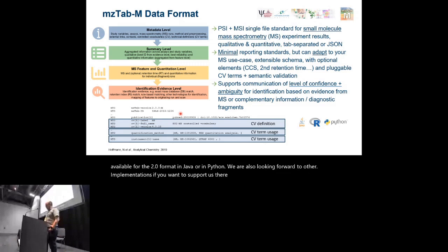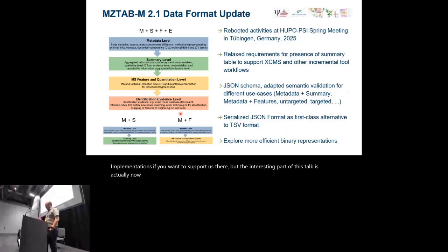But the interesting part of this talk is actually now coming. So we are currently in the process of rebooting the activities to define the update of mzTab-M 2.1. We recently met in Tübingen at the HUPO-PSI to discuss these and prioritize some of these actions.